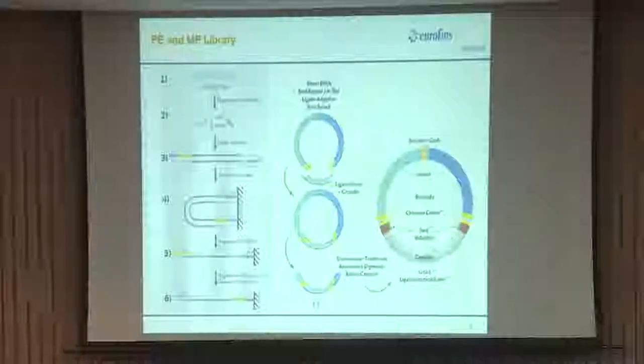It's a 38 base pair sequence which identifies the direction of the read. The sequencing chemistry is the same as this, but the direction is just opposite. It is reverse and forward. Got my point? The sequencing is reverse and forward. So when it is reverse and forward, the distance between the two reads is huge. The distance between the two reads will be like this. This will be roughly the distance.